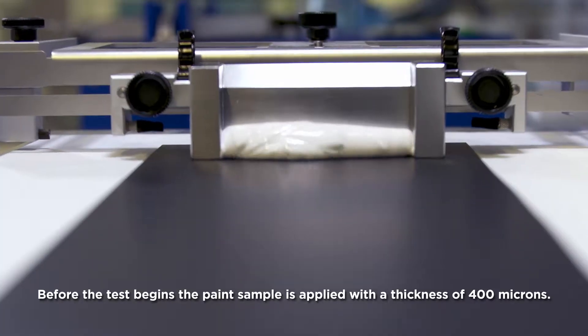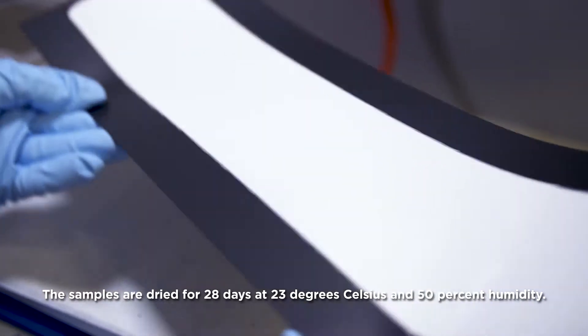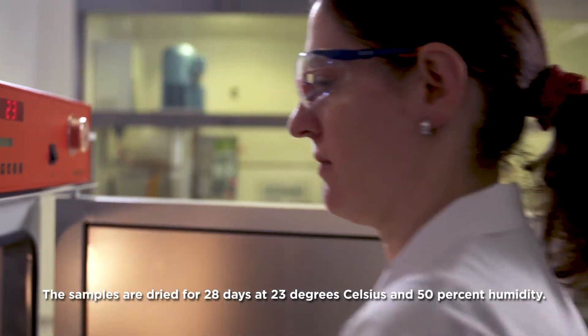Before the test begins, the paint sample is applied with a thickness of 400 microns. The samples are dried for 28 days at 23 degrees Celsius and 50% humidity.